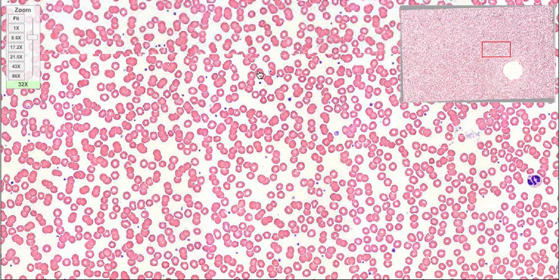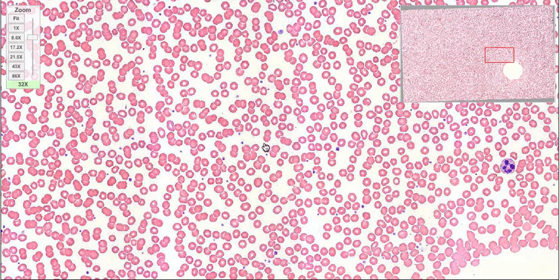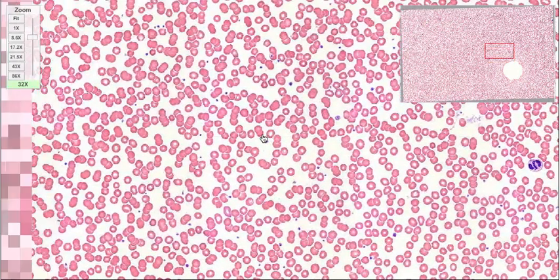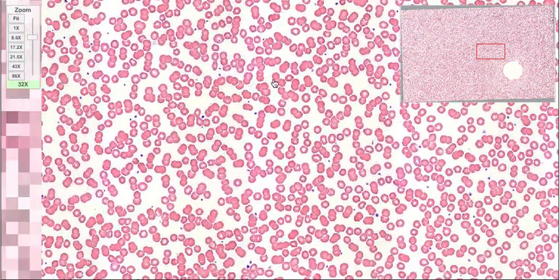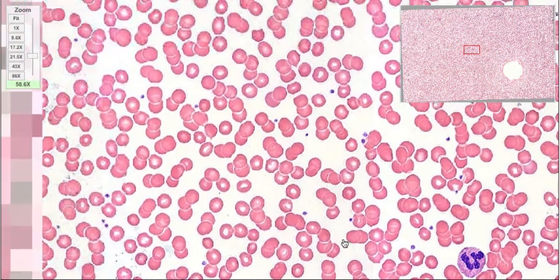So one very distinguishing trait of red blood cells is that they're everywhere in the blood, so they make up a lot of the surface area of a blood smear. They contain no nucleus. They're almost donut shaped, so you can't miss them. You'll spot them straight away. They're in your face, and you essentially can't go past them.